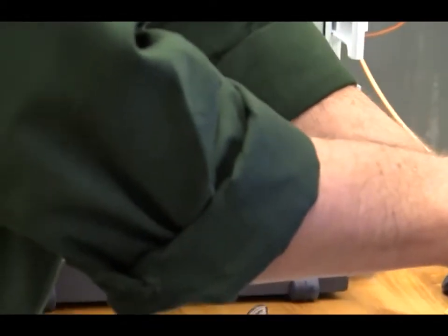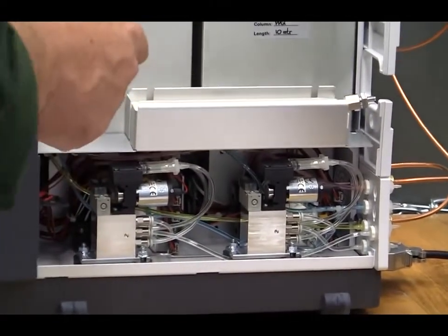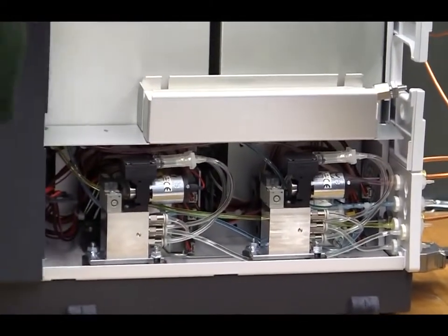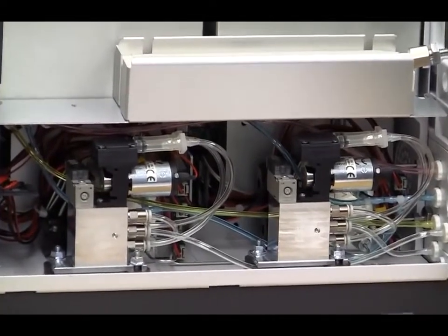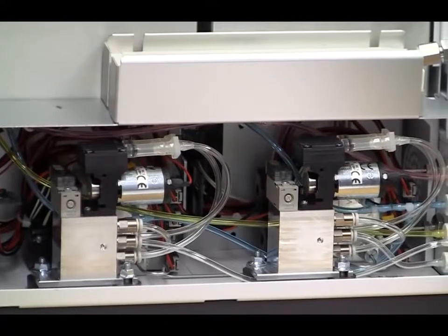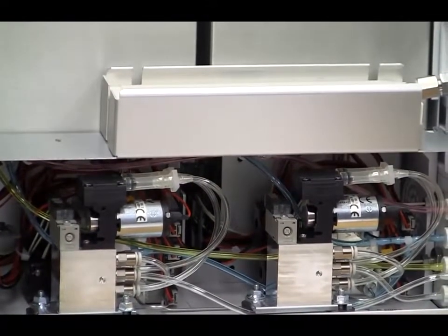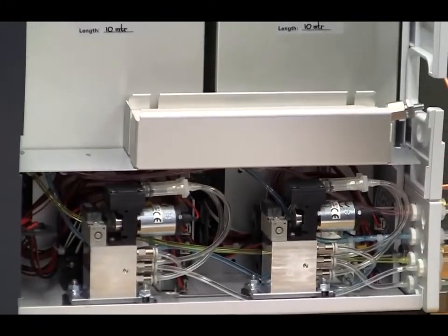Now, I would recommend putting a valve on both of these so you can shut them off. There's a couple of reasons for that. Number 1, it's easy to flush these guys out because, by definition, the way this works, it's got that little dip tube in it, so it's got a little bit of air in it, so always flush it 2 or 3 times. It's not as important on yours, I don't think.